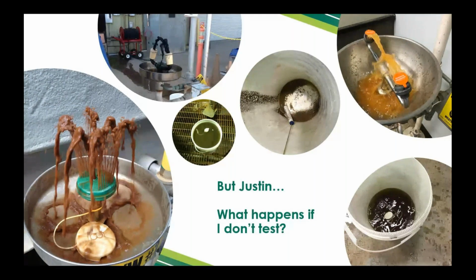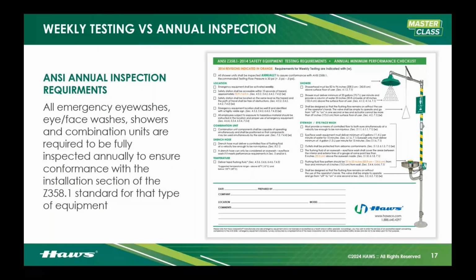Now on an annual basis, you have to do a head-to-toe evaluation of the emergency equipment once a year. That's it. We have to test it. We have to measure it. And I'm going to walk you through everything that's required right after a quick poll question.